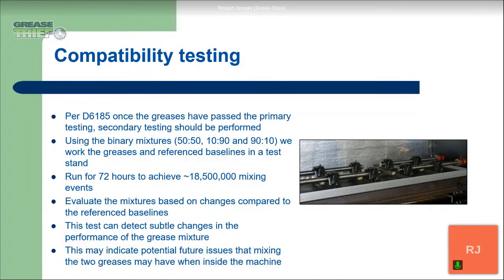Sometimes you find that the 50-50 might be okay, but the 10-90 and 90-10 are not satisfactory, and you find that you'll have problems right at the beginning when you're introducing one grease, and at the end when you're almost on to the new grease fully. So it's important to look at all those mixtures to have the full picture and understand, is there going to be a negative impact mixing these two greases together.